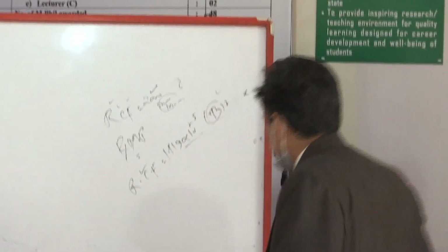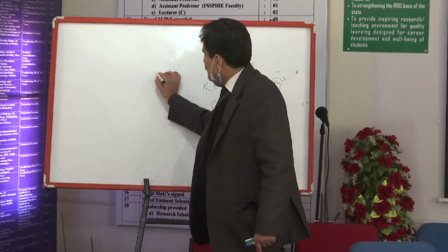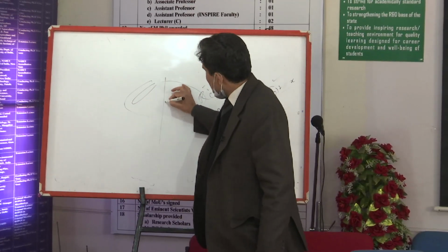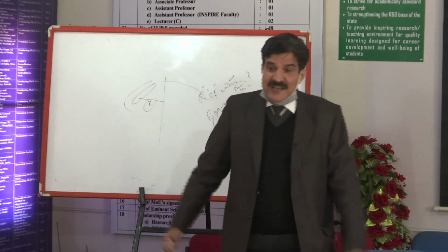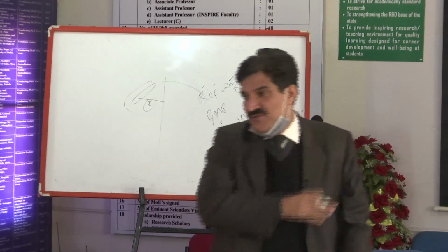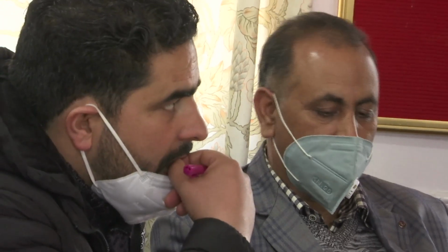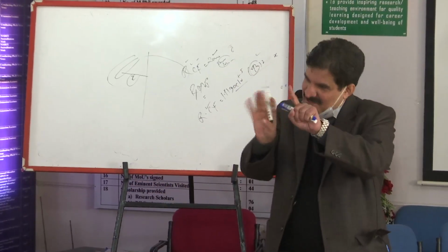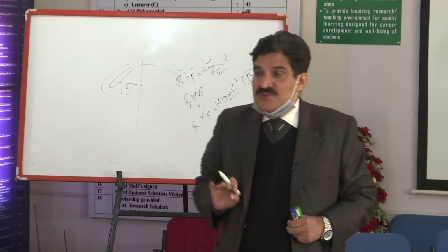The axis of rotation is the line of axis about which the rotor is moving, and you have a centrifuge tube here. This centrifuge tube contains matter, and that matter is at a distance of x. Depending upon the long axis, you are going to have more centrifugal force, even in a single machine. Sometimes it is written as RCF, sometimes as RPM, so no problem, you can utilize that. Nowadays machines are available which give their RCF converted into RPM. So you are centrifuging it.